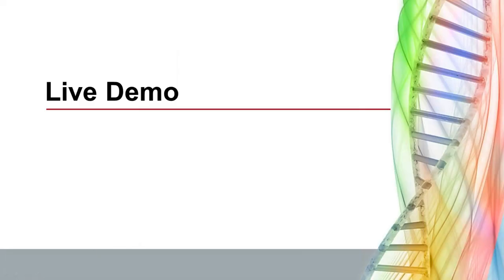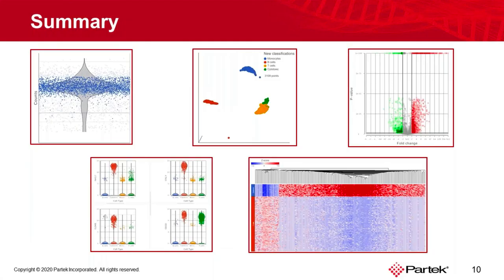In summary, I've taken you through how to work with single-cell QA/QC plots, UMAP and PCA, volcano plots, dot plots, violin plots, and heat maps.